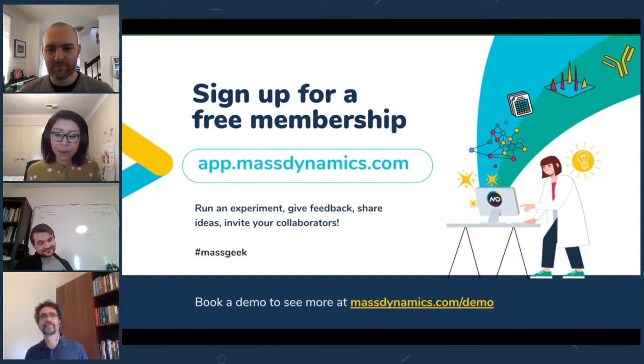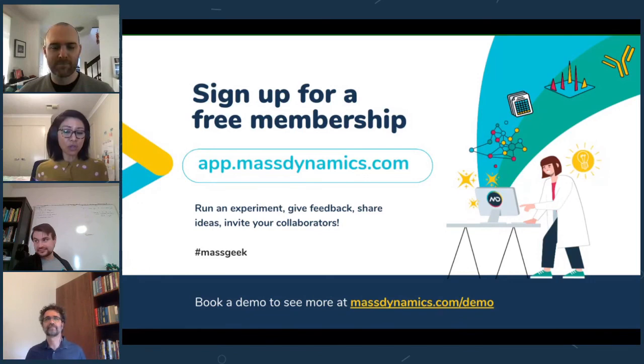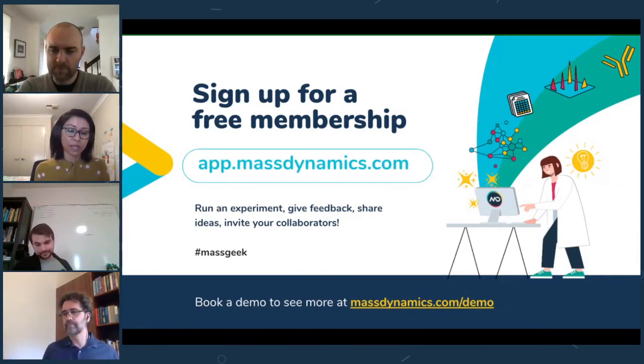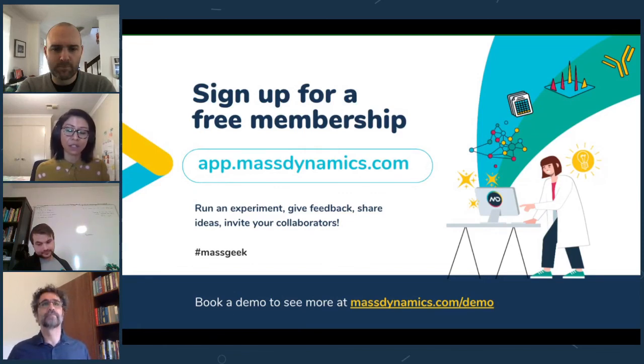Now, a question has come up around, can we use peptide mapping now? So the answer is you can use it with demo data. If you hop on to app.massdynamics.com and create an experiment, you'll see a big button that says use demo data, and you can do that. Beyond that, it'll take some time. I believe there are going to be a couple of free raw processing experiments within the free plan, which will be released very, very soon. So the answer is yes, but it'll be demo data.